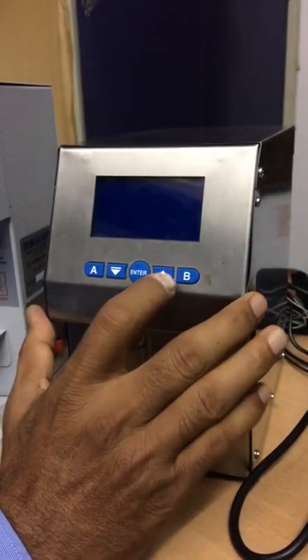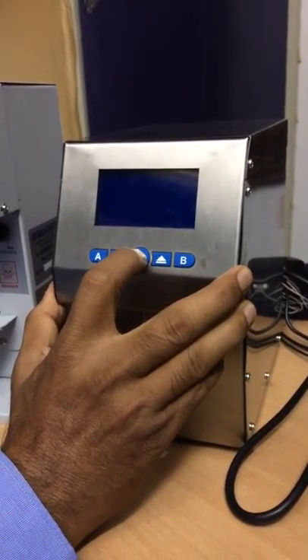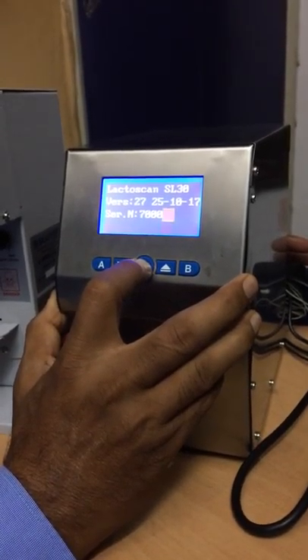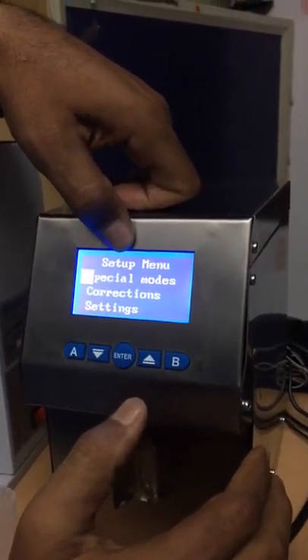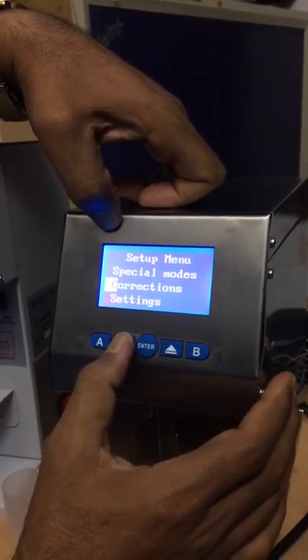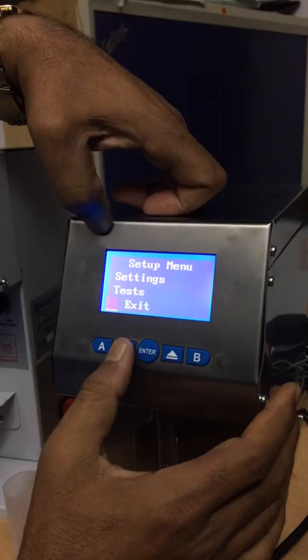I turn off the analyzer, press and hold the Enter button, then turn on. Now it goes into setting mode. Here the setup menu shows: Special Mode, Corrections, Settings, Test, and Exit.